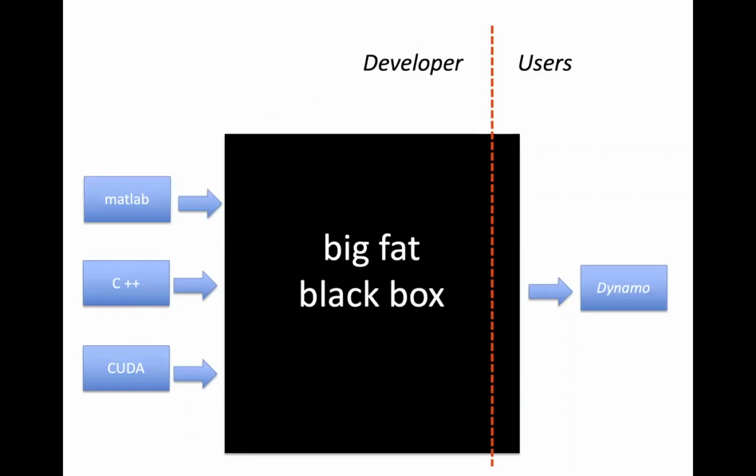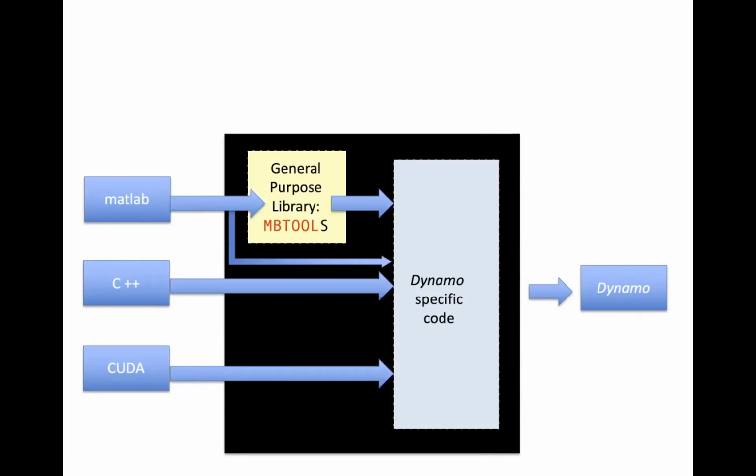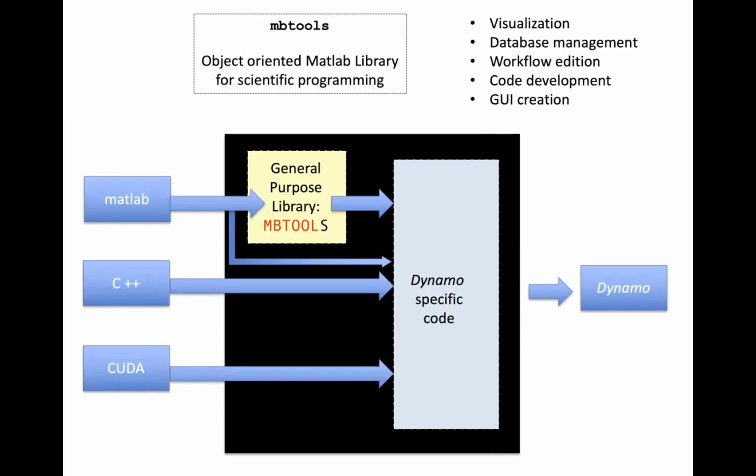For the developers, I want to underline that, yes, we put under the same roof MATLAB, C++, and CUDA, and inside this black box, there is a different software that we also develop, the MB tools, that has nothing to do with tomography, has nothing to do with subtomogram averaging. It is a general toolbox that extends enormously the functionalities of MATLAB for visualization, database management, workflow edition, many things that you normally need when you are developing scientific code.